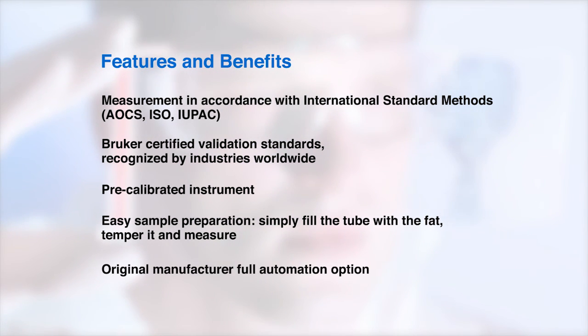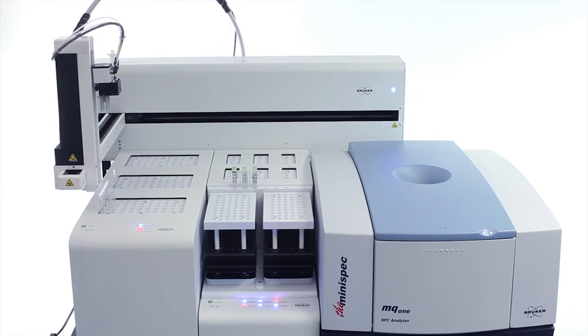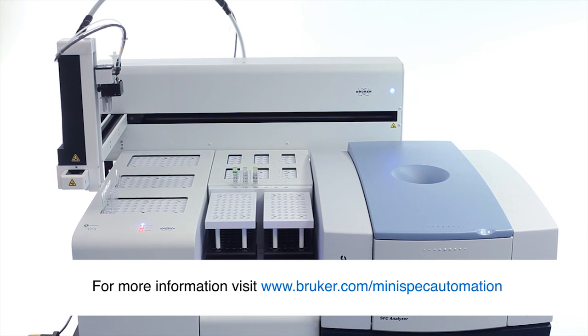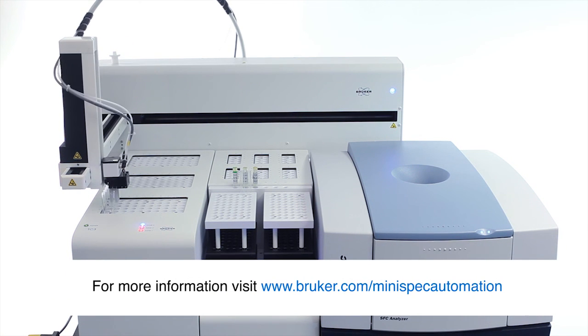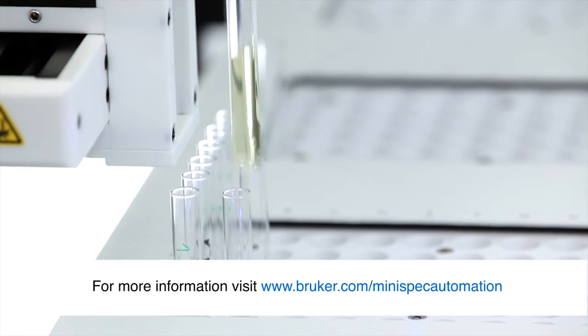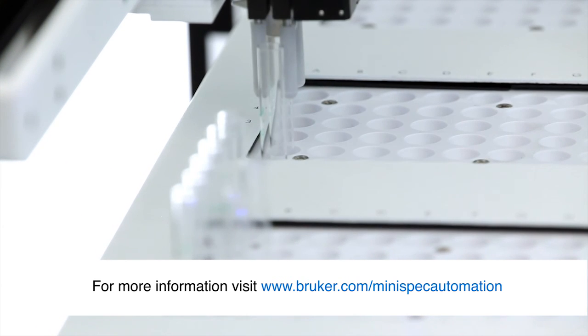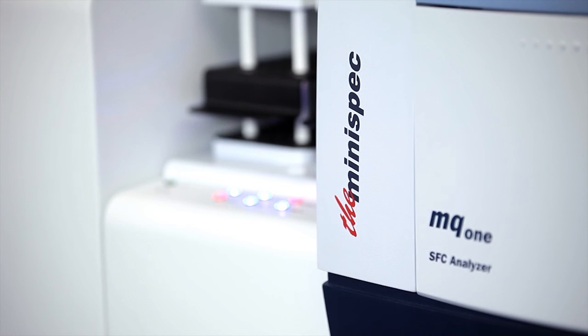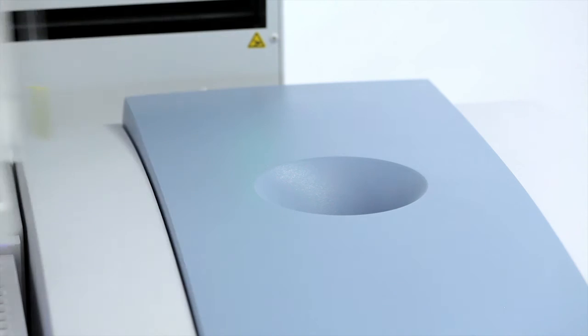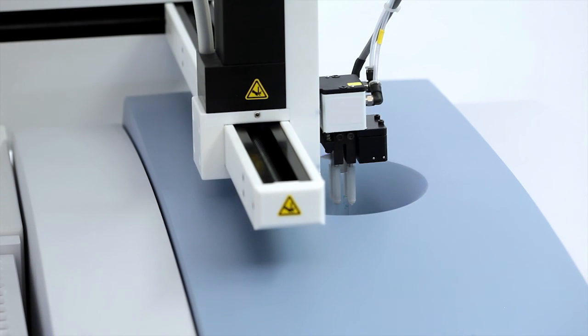Existing minispec systems from the MQ and MQ1 series can be upgraded to a fully automated system. Bruker also offers a fully automated solution including tempering procedures, the time domain NMR measurement, and thereby the determination of the SFC value with presentation of the melting curve. For more information or support, find us at Bruker.com.